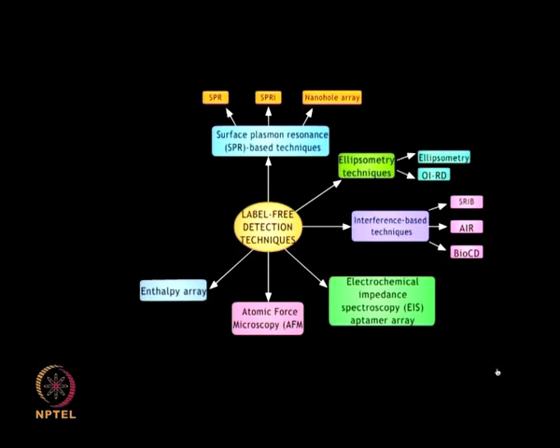Aptamers are short single stranded oligonucleotides that are capable of binding to a wide range of target biomolecules.